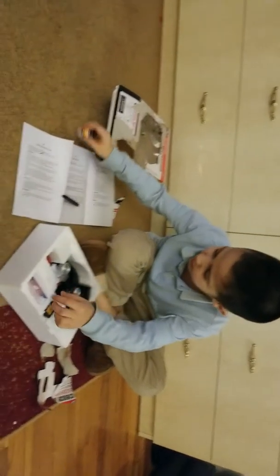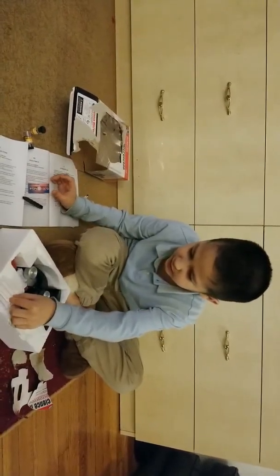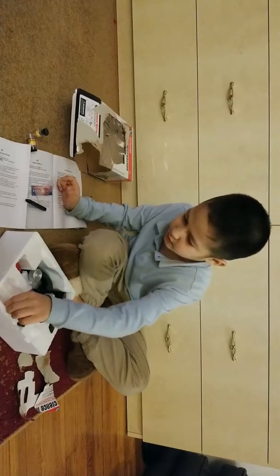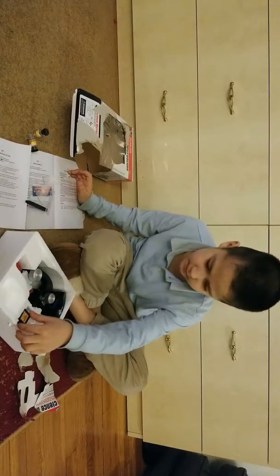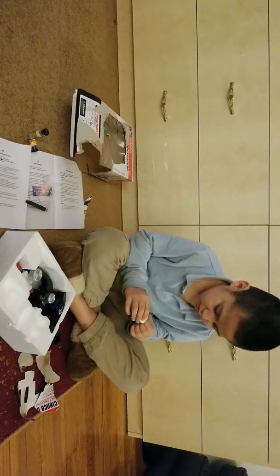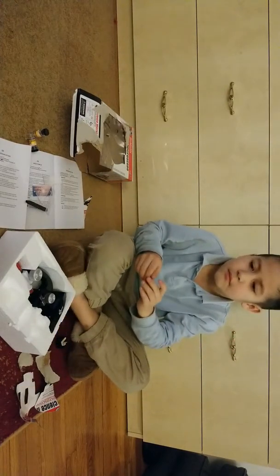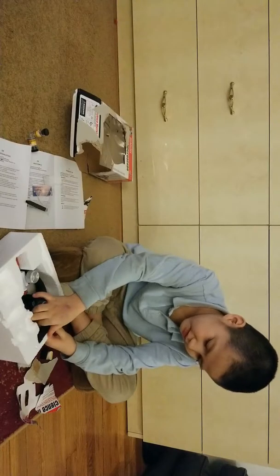The manuals. Oh, the damage. Let's see — doesn't look like we need it. We're going to put this right here. Sorry guys, my dad put it in the camera. These are the things to put it in. What are these, tubes or no? I think it's special glass. I think I'll just take that out. So put it on a piece of paper so it won't get damaged.